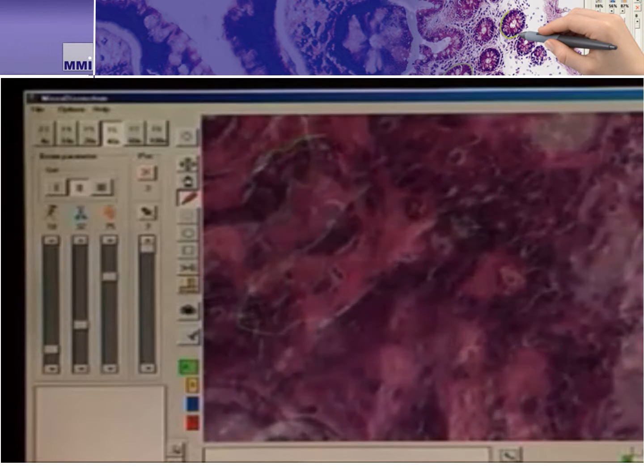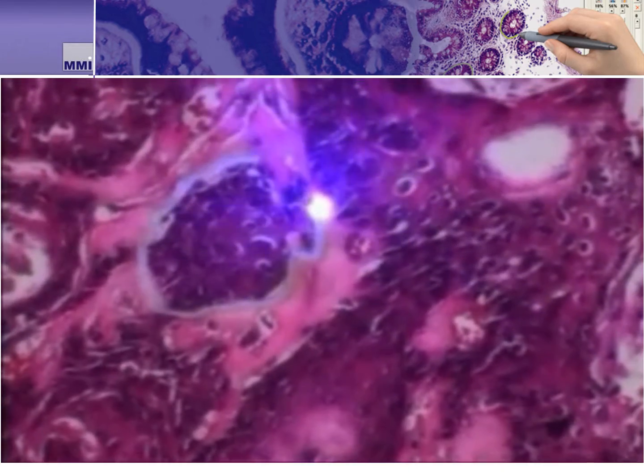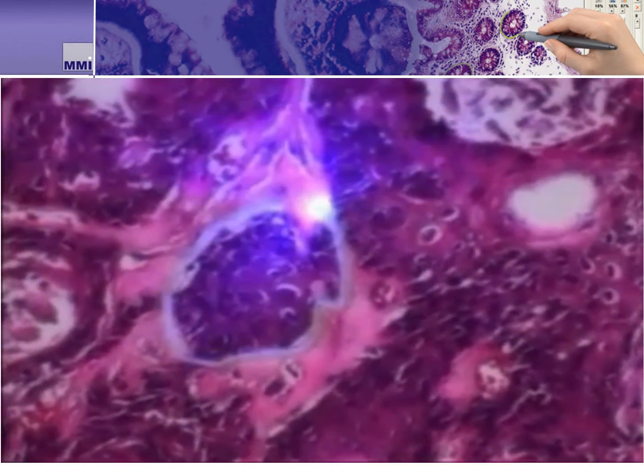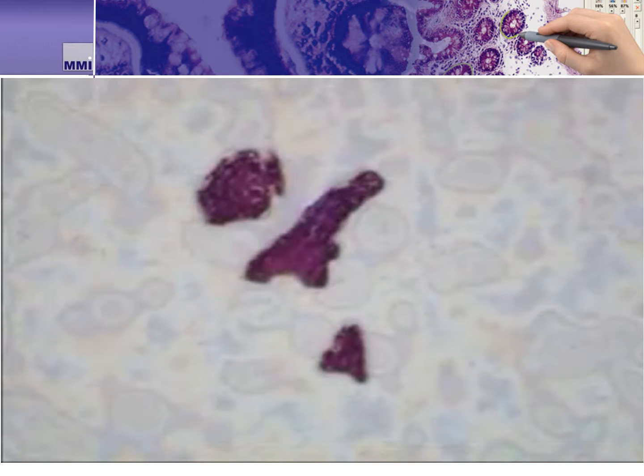In this video we see the same type of line being drawn, but this time using the computer's mouse. The system then begins to cut with the 355 nanometer UV laser. We use the 355 laser as it is powerful enough to cut most samples, and even if the sample is thick, we have a method to address this, which we'll cover later in the presentation.